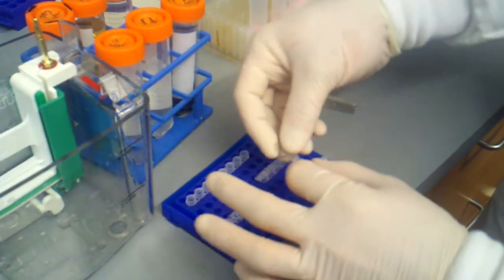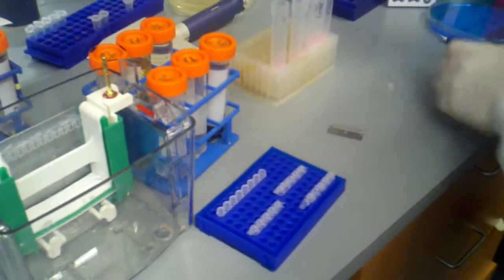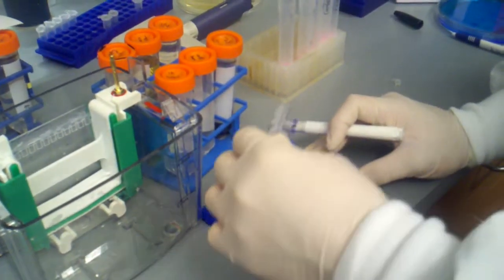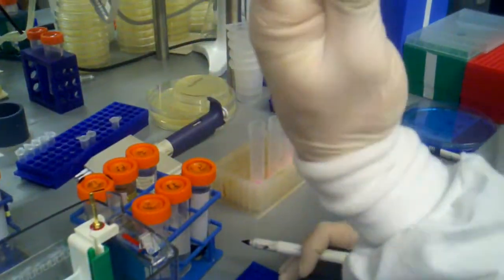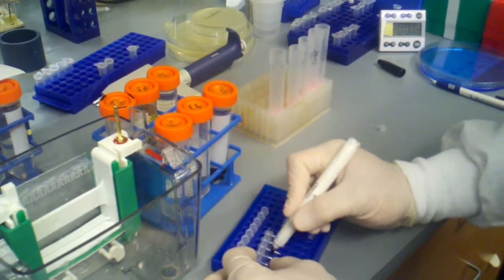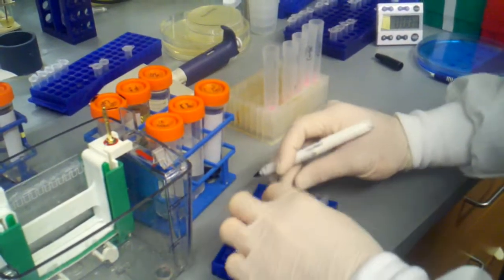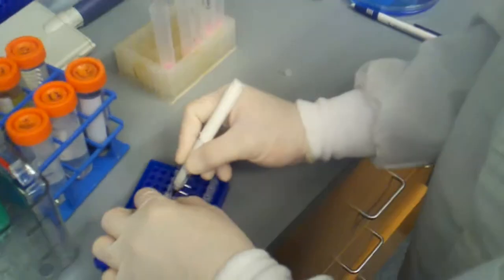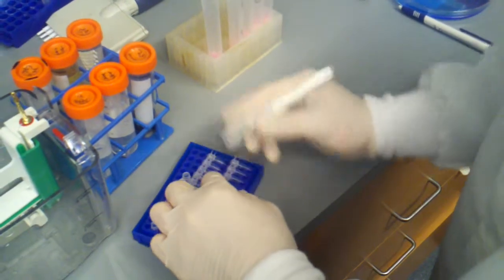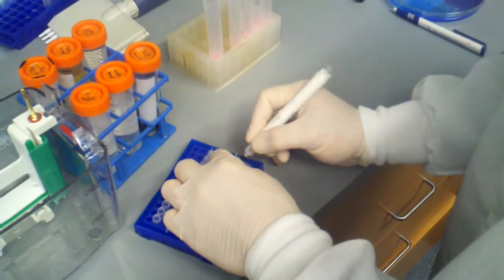And I haven't rearrayed my tubes or anything yet, because I want to number them. So it's very important that you keep track of what your samples are, because if you pick, let's say I pick this up, and then I go like this, I'm like, uh-oh, which sample's which? So the first thing you always want to do is definitely label. So I'm going to use a very simple labeling system. 1, 2, 3, 4, 5. Kind of gives you directionality and what is what. I'm going to continue. 6, 7, 8, 9, 10. And then we have 11, 12, 13, 14, 15.